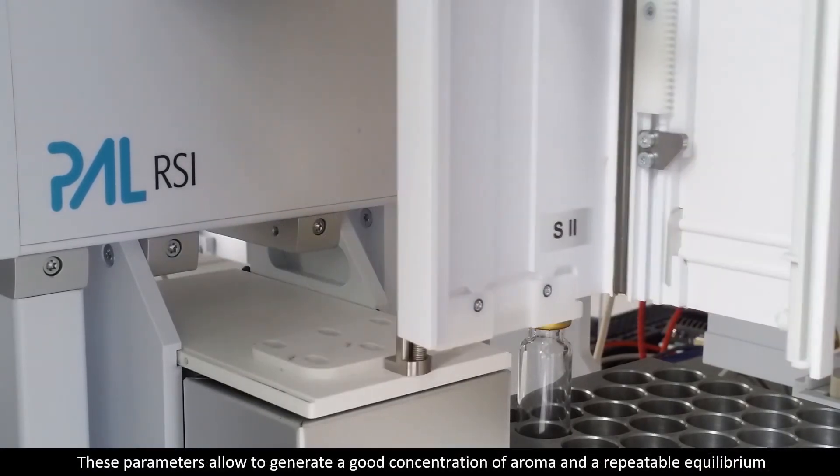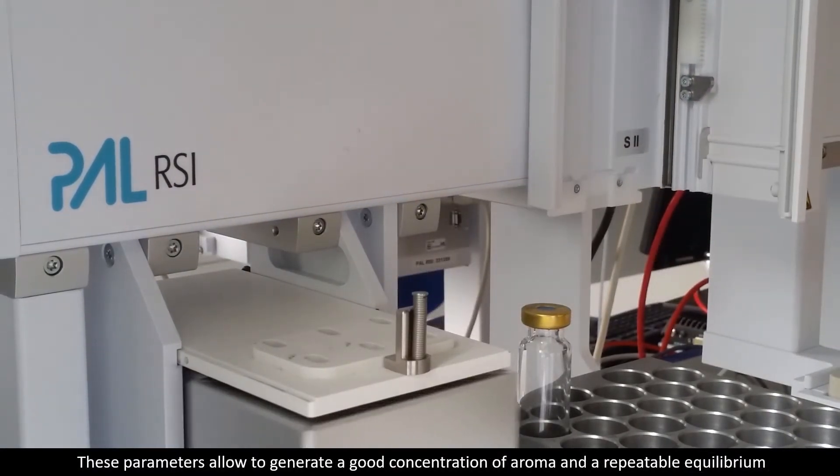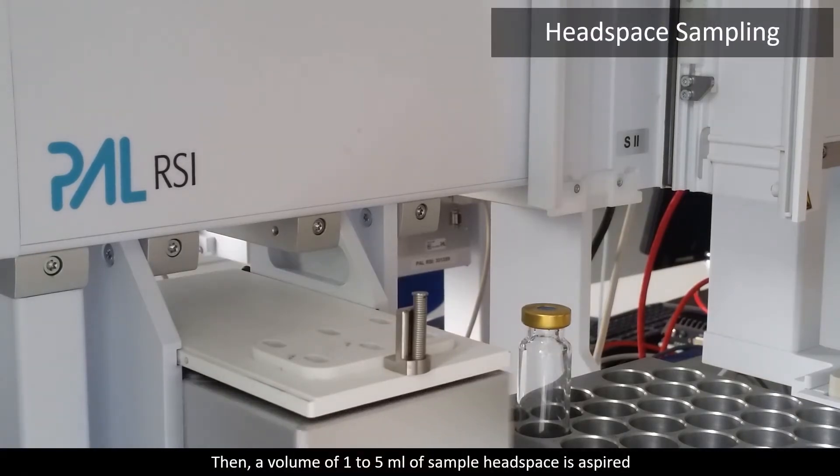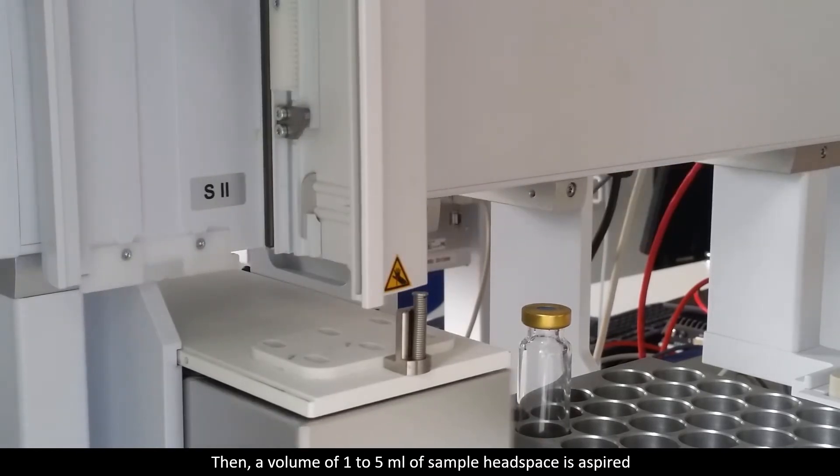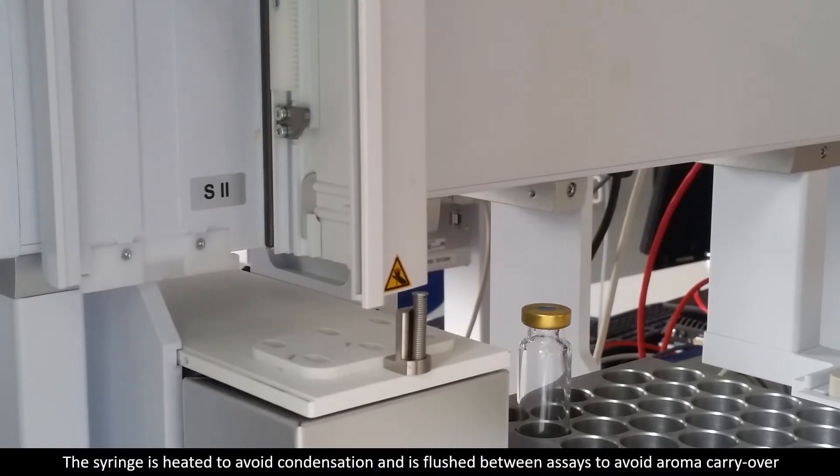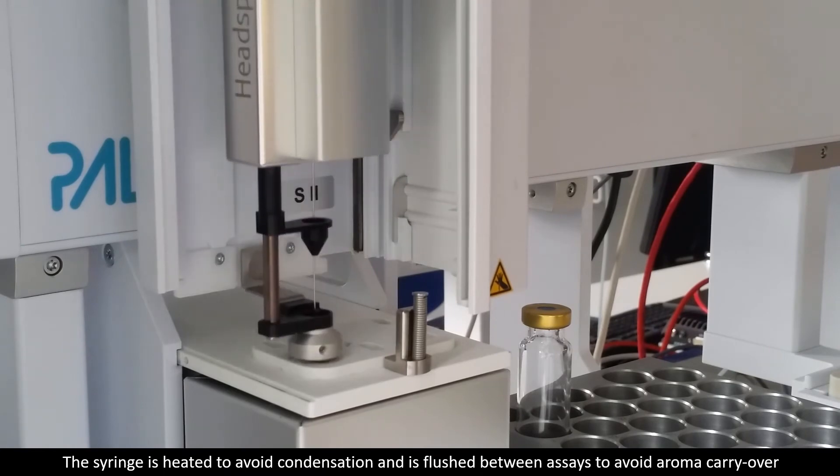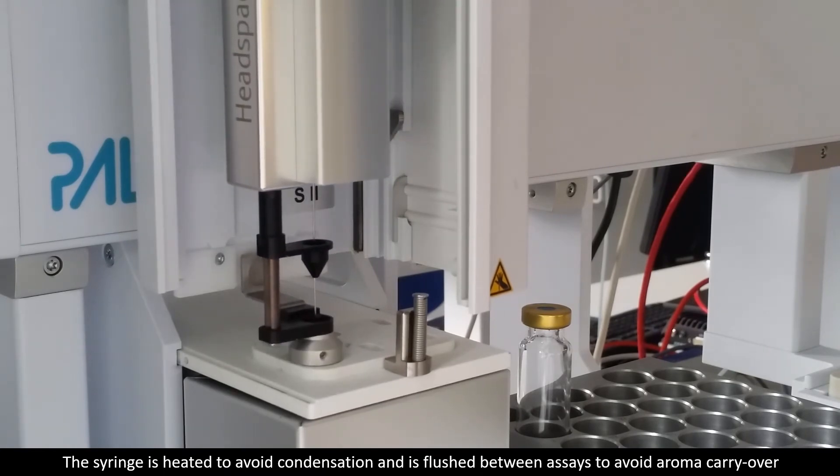These parameters allow to generate a good concentration of aroma and a repeatable equilibrium. Then, a volume of 1 to 5 ml of sample headspace is aspirated. The syringe is heated to avoid condensation and is flushed between assays to avoid aroma carryover.